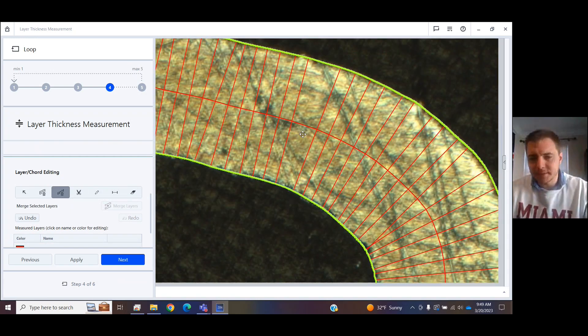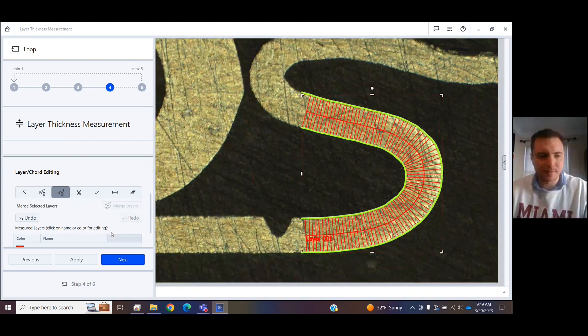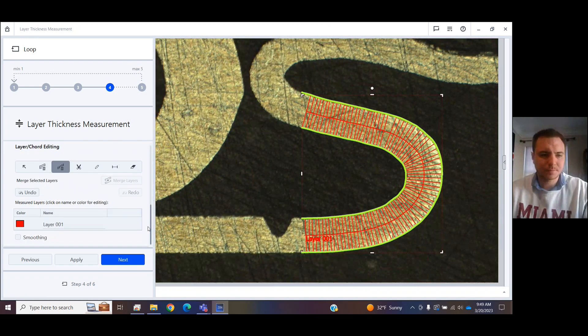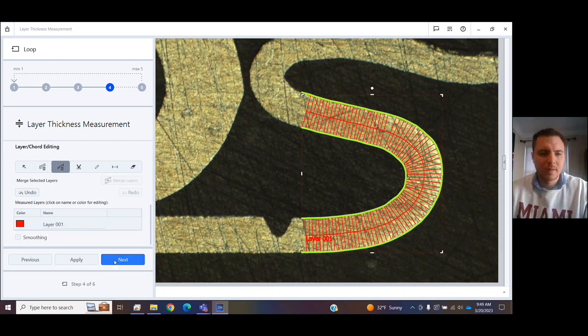Easy to do. And it's taken a bunch of measurements throughout it. So I can click Next.